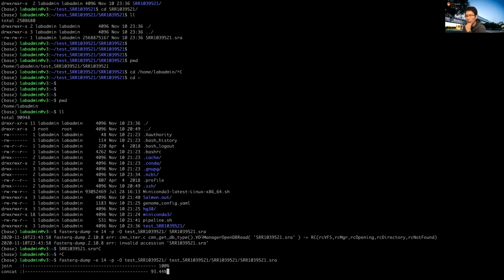By the way, for Mac people and also for Windows people, if you want to download or upload files to the computing server, there's a way to do it with CP or SCP, as Dr. Fungan introduced last week. And there's another way to do so. For MobaXterm on Windows, it should be easy. You can drag and drop. You can see all the folders in the Linux machine.